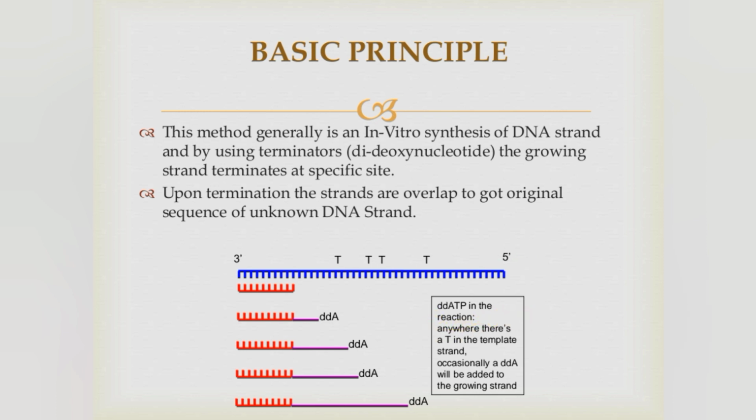With ddATP in the reaction, anywhere there is a T in the template strand, occasionally ddATP will be added to the growing strand.